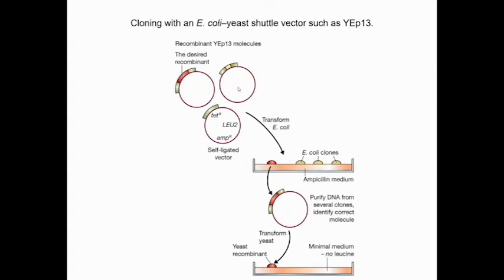And then you can take these 3 different types of DNA molecule and transform into the E. coli, all right, transform into the E. coli, and then you perform the selection through the.